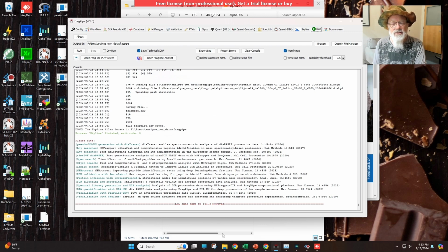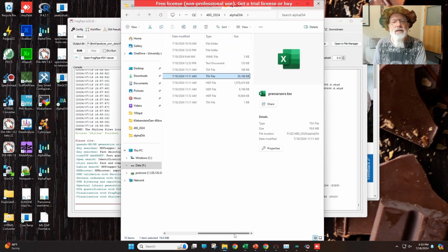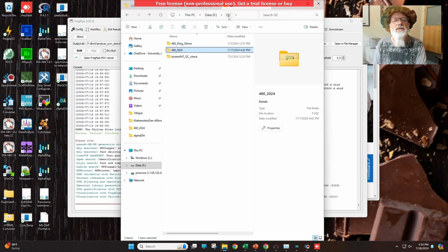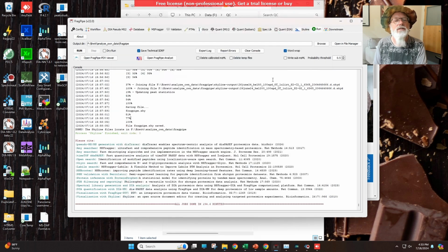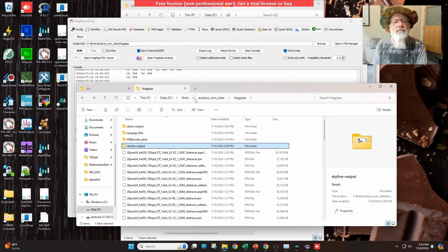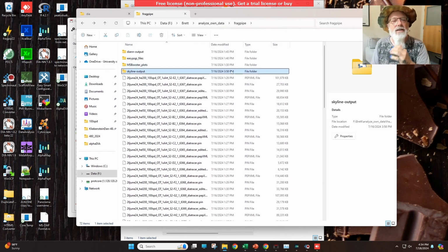The first thing we want to do is look at the output data. Where did I put it? Under FBRET, analyze your own data, FragPipe. You see a ton of files in here.